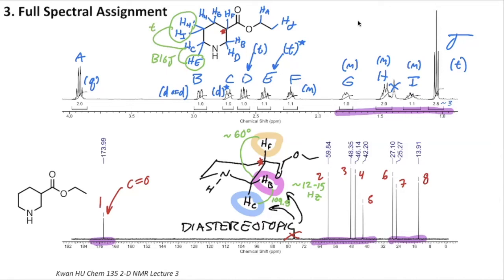So we'll label that splitting as kind of a triplet for a smaller J. And as I mentioned before, the geminal splitting of C by E would be the doublet for a larger J. So we would call this a doublet of triplets. You always read the big J and then the small j. And I think if you use a little bit of imagination, you can see that peak shape here, that it looks like a couple of messy triplets that are kind of smushed close together to form a doublet. So a doublet of triplets.